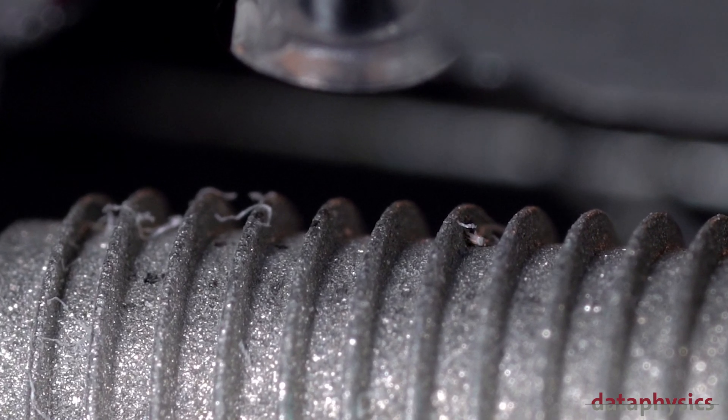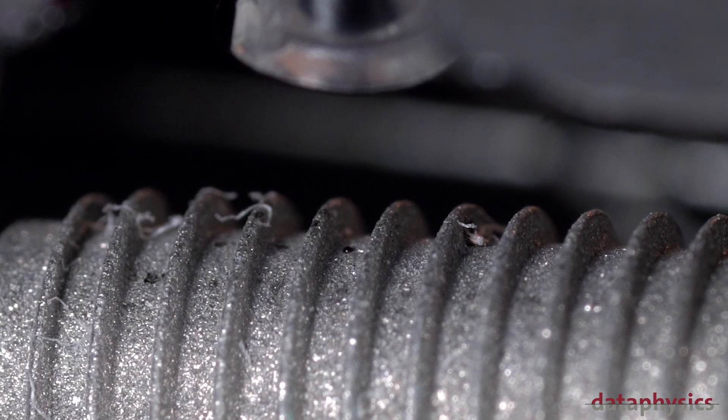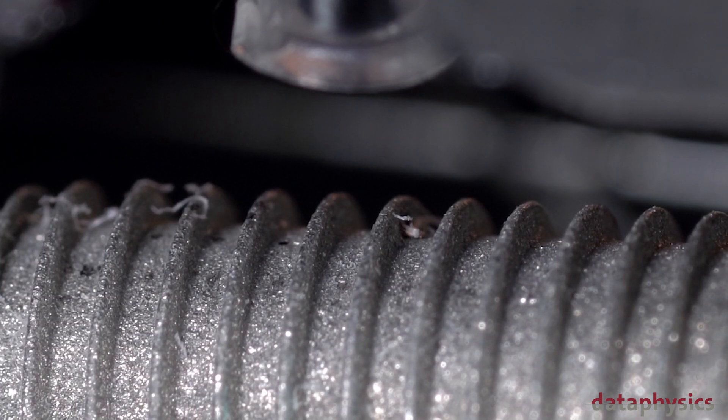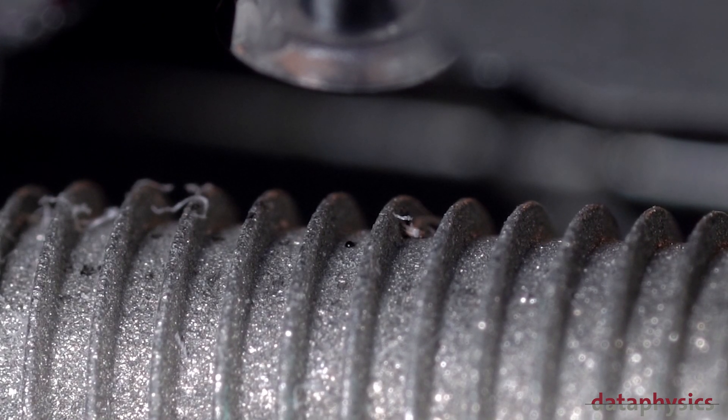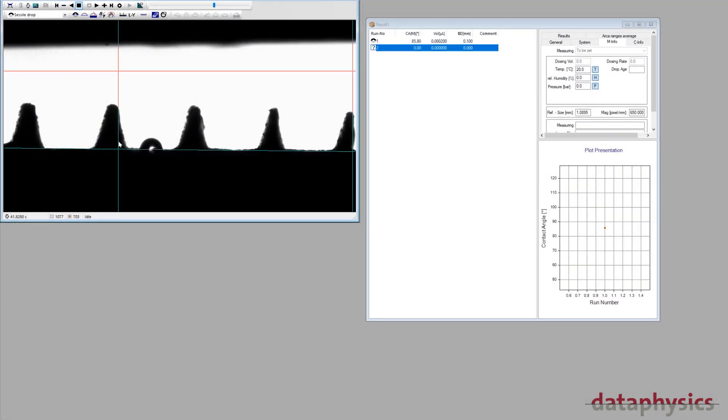Since these exceptionally small drops tend to evaporate quickly, the entire process is recorded with a high-speed camera. And the video which is recorded can then be evaluated with the easy-to-use SCA software.